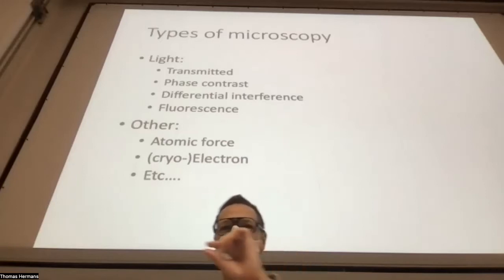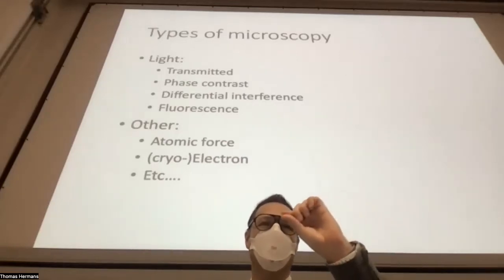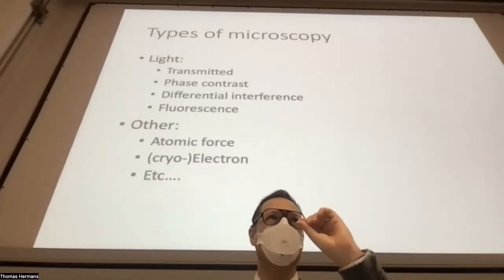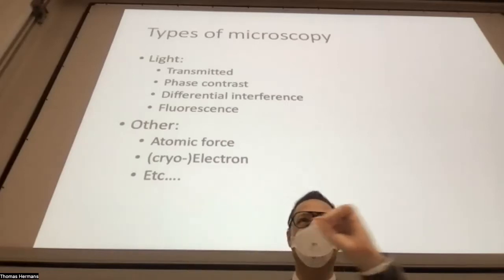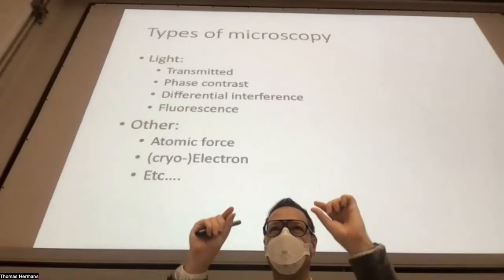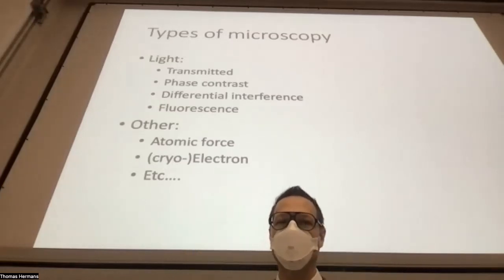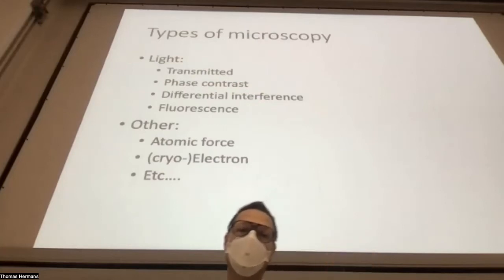If I give you a very thin slice of a plant, maybe 10 or 100 micrometers thick, and you just use transmitted light, it might be difficult to see any contrast, right? Because you have Lambert-Beer. If the absorption coefficient is quite similar and the length is very similar, it's going to give you similar absorption. So there are actually techniques to increase the contrast in transmitted light.